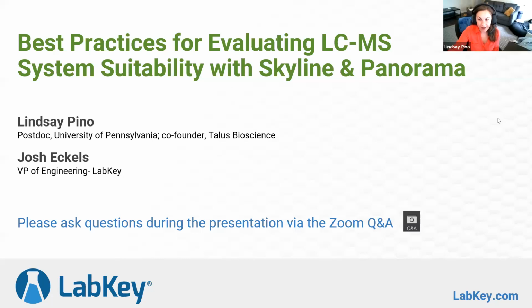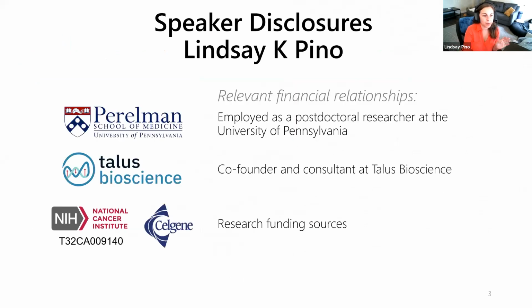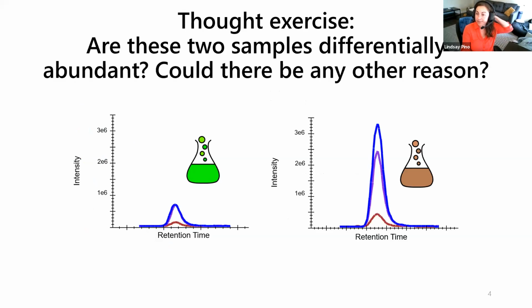Yeah, thanks, Josh. If you've got questions, hit the question and answer at the bottom of the webinar screen, and we will be getting to those. Hopefully we will answer most of your questions throughout these slides. This first part, we're going to set up the concept of system suitability and quality control in these samples. Really quickly, my financial relationships: I'm currently employed at the University of Pennsylvania as a postdoc, but I'm also a co-founder and consultant at a biotech startup called Talus Bioscience.